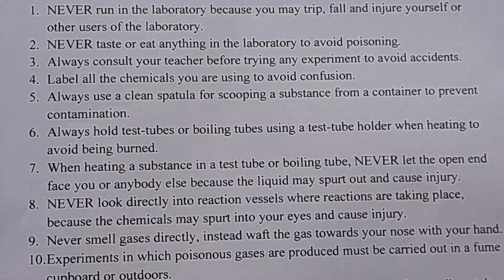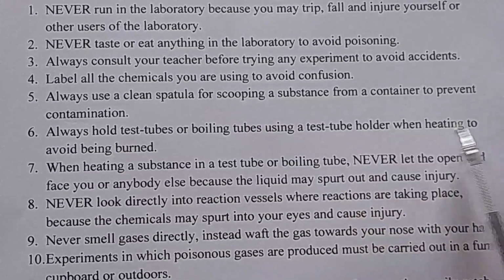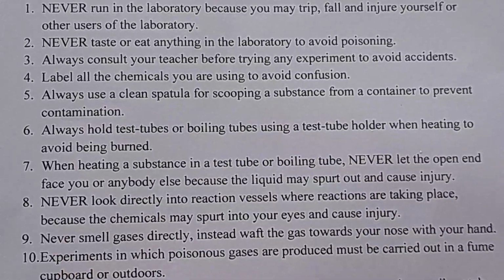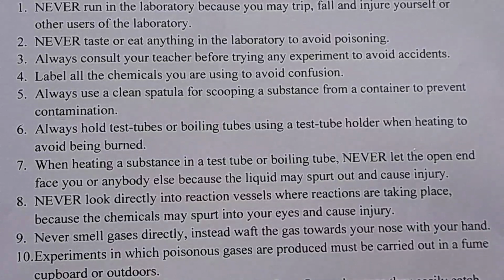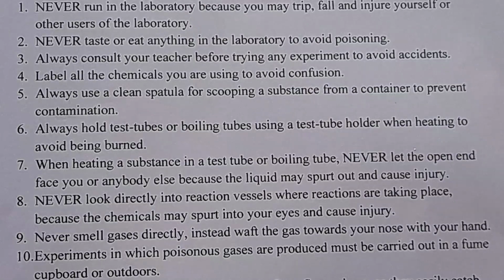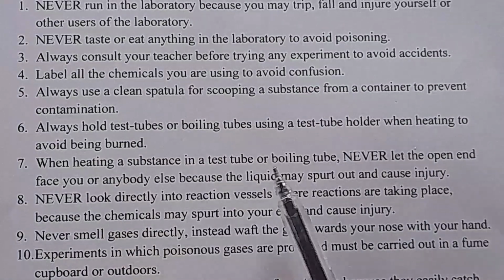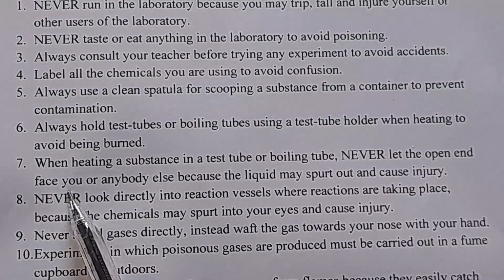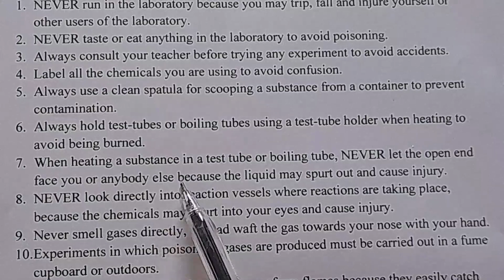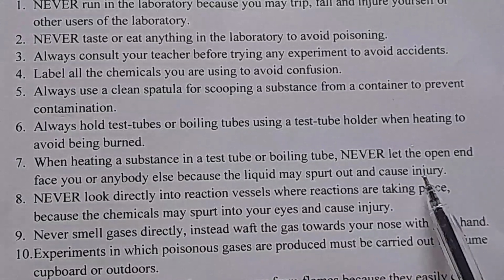Then number six, always hold test tubes or boiling tubes using a test tube holder when heating to avoid being burned. So you have to use a test tube holder. A test tube holder, we said, is used for holding test tubes and boiling tubes during heating. Number seven, we are told when heating a substance in a test tube or boiling tube, never let the open end face you or anybody else, because the liquid may spurt out and cause injury.